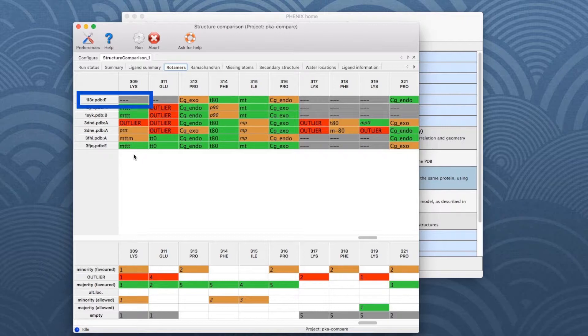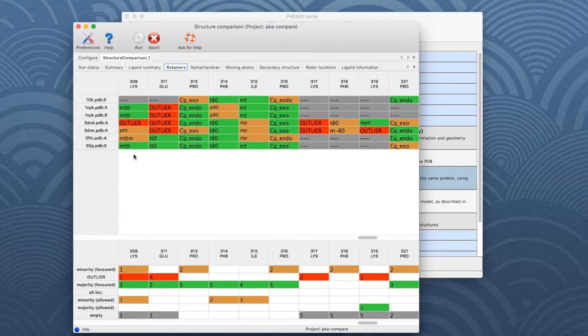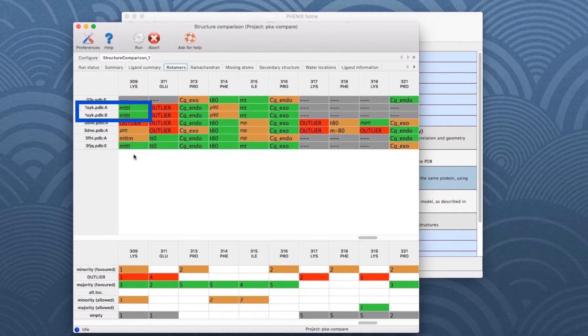The cell for model 1L3R is grey, which means this residue is missing or incomplete. If more than half of the side chains for a common residue have the same rotamer, the cell is highlighted in green, which is the case for chains A and B of model 1SYK and chain E of model 3FJQ.